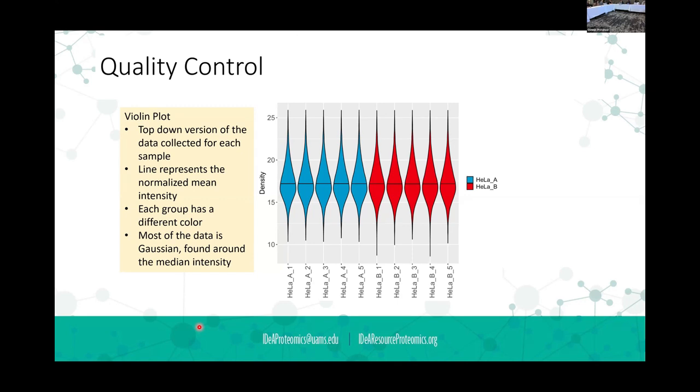In a pull down, we saw this family of proteins that were twofold upregulated. And it wasn't expected. They didn't expect that this would be interacting. And we went back and looked at the inputs, and those proteins were twofold upregulated in the input. And so what we were seeing was just a background of the non-specific interaction of the proteins, mimicking their original concentration in those inputs. So you also did a mass spec? Yeah, we did a comparison of the inputs, yeah.